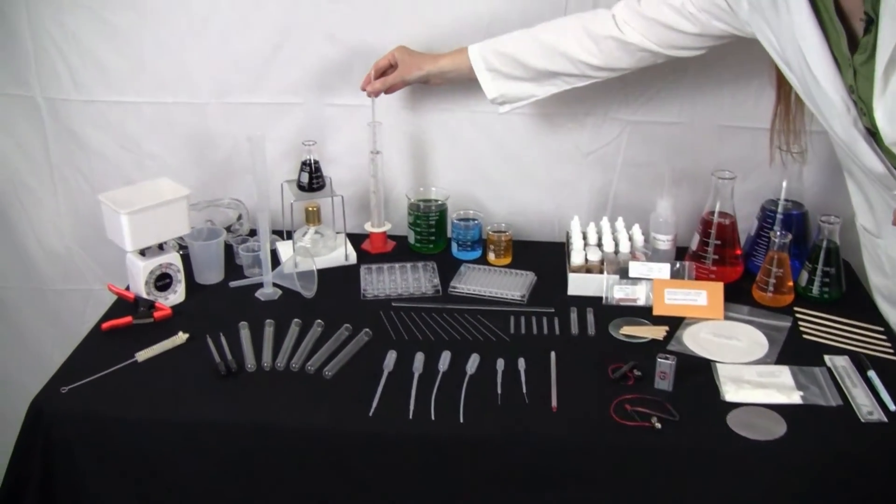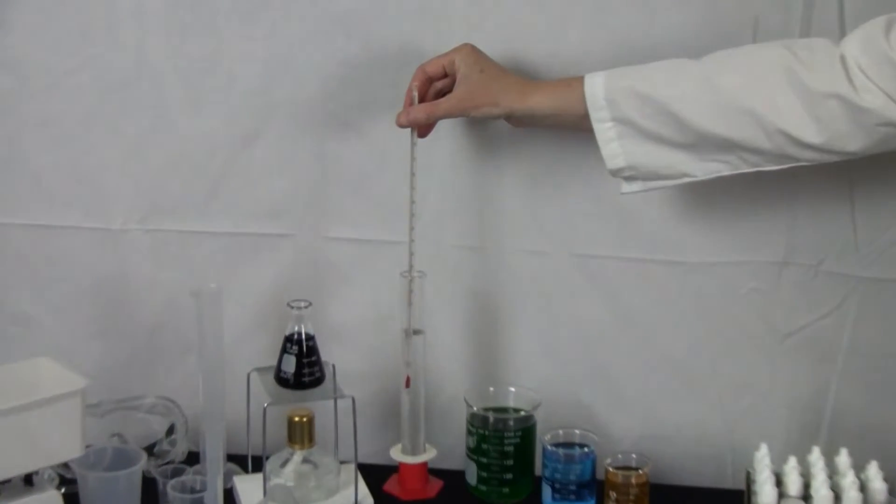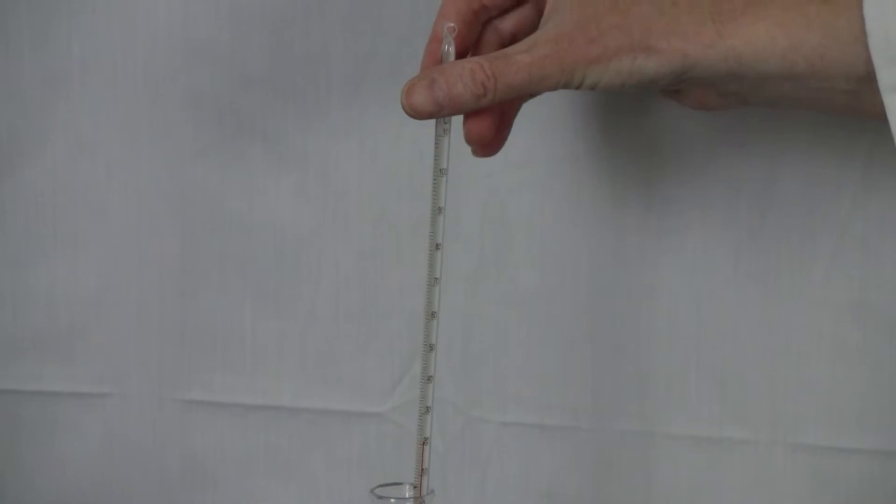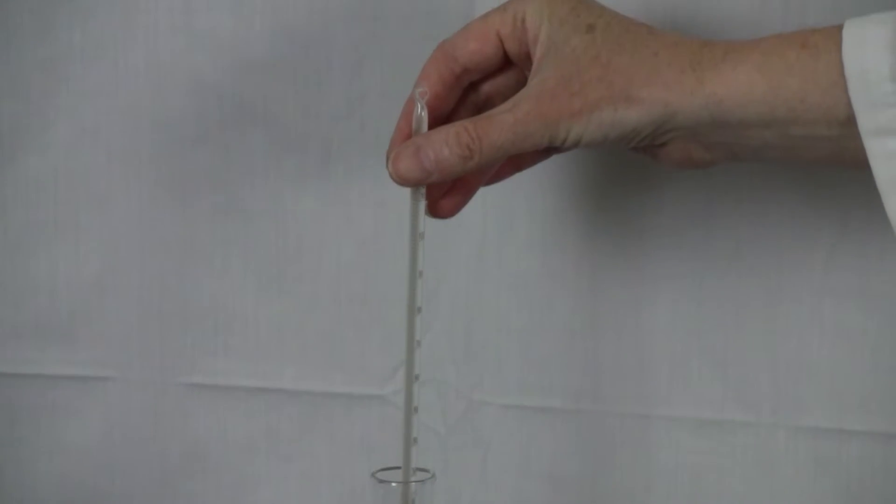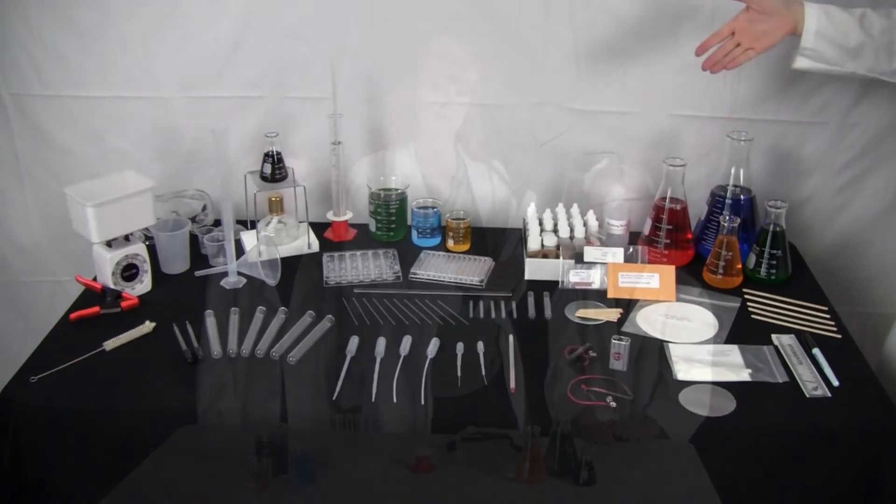And last but not least, here is the thermometer so you can measure the heat of any particular solution. So here we have all of our chemistry tools.